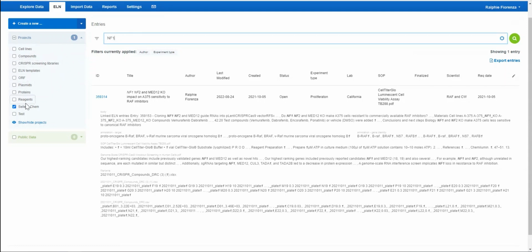Searches can be comprised of project-based searches because all ELN entries will reside within a project in your own vault. In addition, you can utilize filtering in order to filter your entries based on the author and custom user-defined fields such as that experiment type dropdown. You can combine this filtering and the project selection with keyword searching, and we will actually return the specific ELN entry and show you where in the body or any attachments like PDF and Excel files we have found your particular keyword.